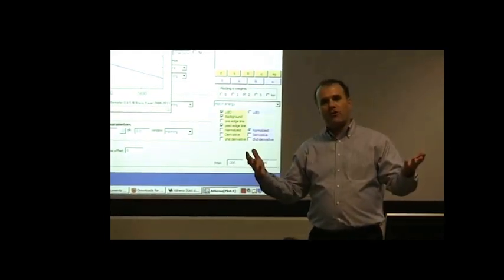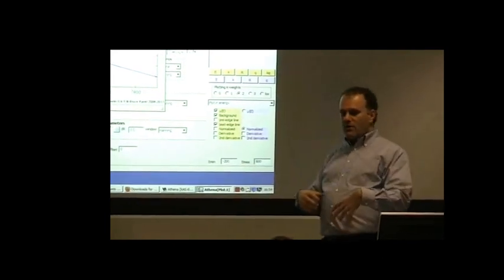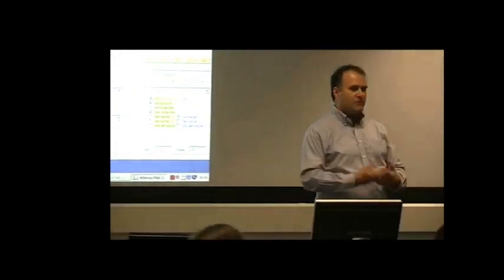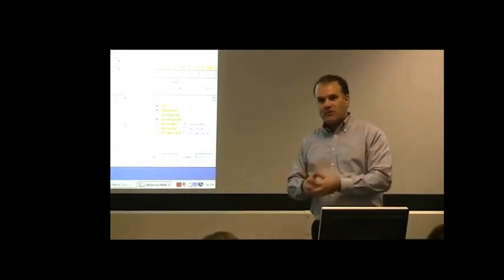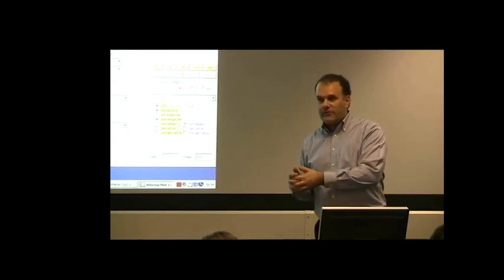So when you're a novice, when you're coming to this for the first time, you might need to spend some time not measuring your research project, but measuring a sample system, a toy system, for which you can back out the answer to convince yourself that you know how to do the data analysis well.